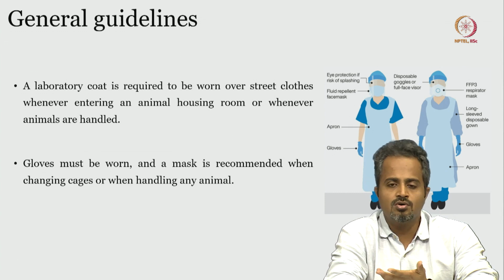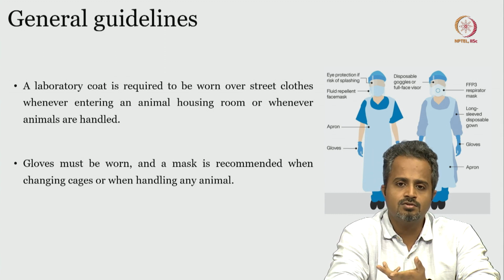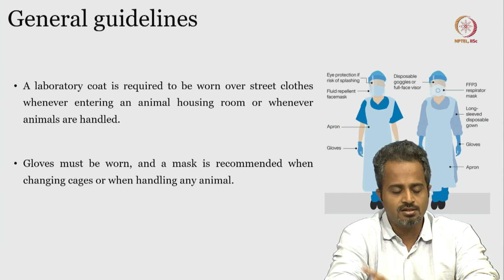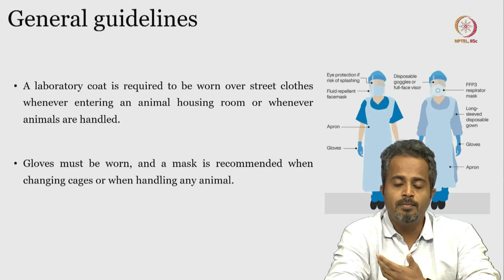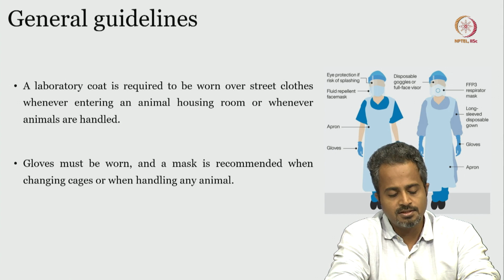That can also transmit agents into the rodent's body, and then your experiment has to stop midway because of the dreaded infection that the rodent has acquired during the surgery. So that's about how you maintain sterility while handling the animal so that no infectious agent can get into the animal's body.